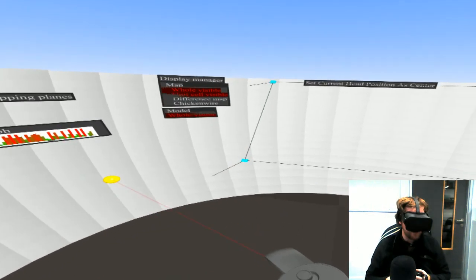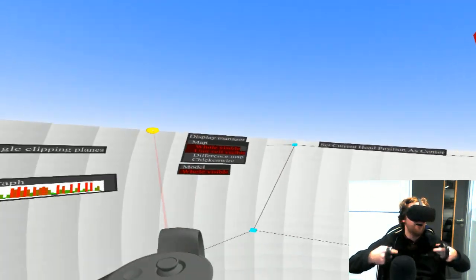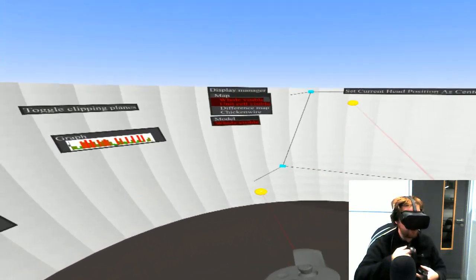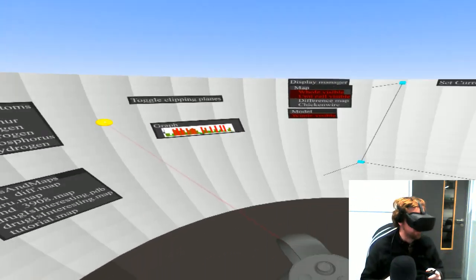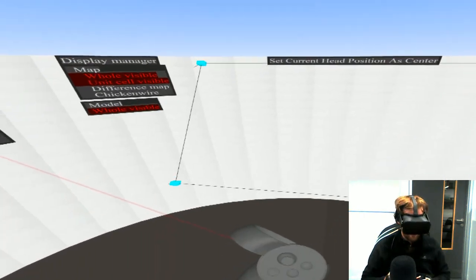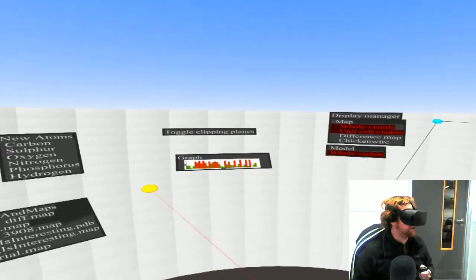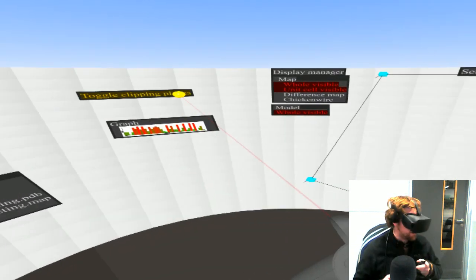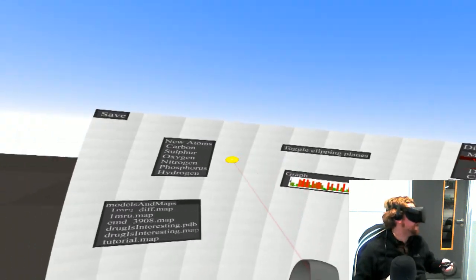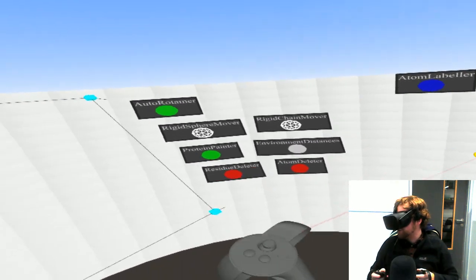And the software consists of the main thing that I use for this, this large shell around me. It's kind of like a computer monitor. I'm just going to do that, so that puts me exactly in the middle, so to speak. And I've got these little things that I'm pointing at, that are the places that I'm pointing at on the panel.